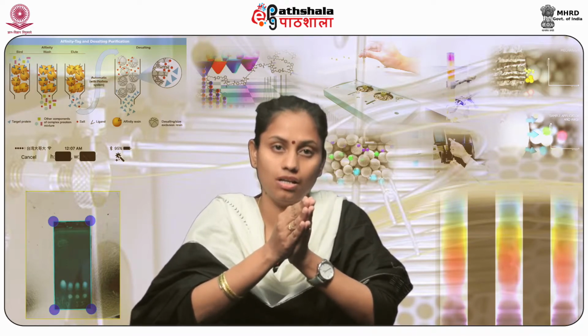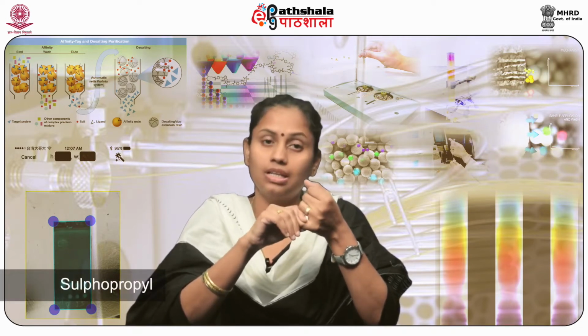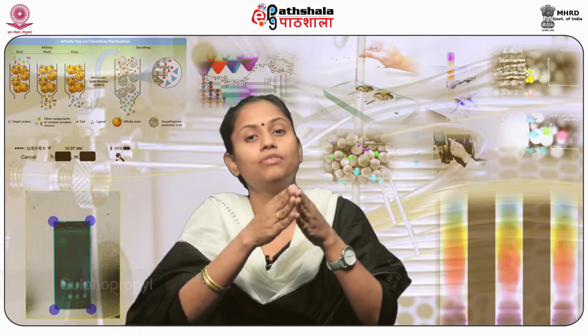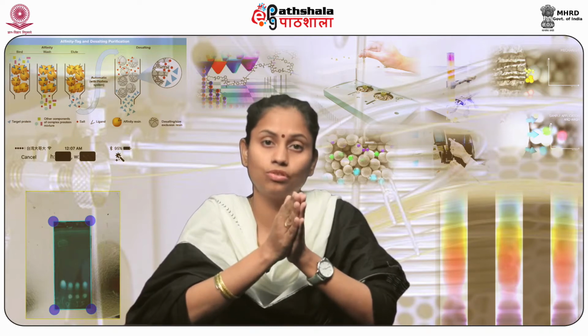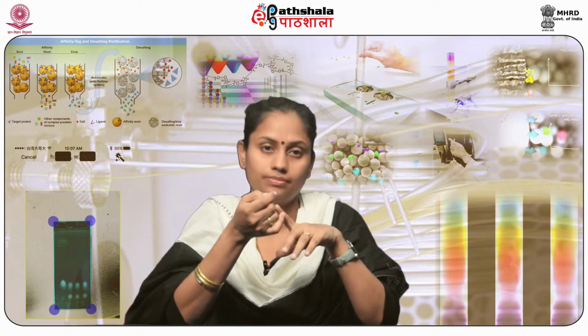The commonly used groups on resins for cationic exchangers are carboxymethyl, known as CM, sulfopropyl, that is SP, and the sulfonic group, commonly known as S. The commonly used groups on resins for anionic exchangers are diethylaminoethyl, that is DEAE, and quaternary aminoethyl, that is QAE.